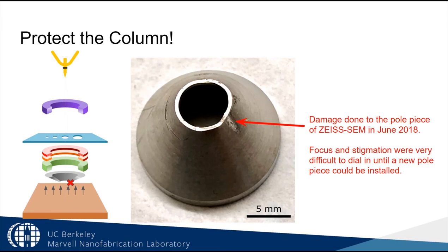This happened to Zeiss SEM in June of 2018, when someone ran the stage into the pole piece, which is a protective piece below the final objective lens. While it was possible to use the tool in this state, it was very difficult to correct the beam conditions. It is very important to be aware of your sample with respect to the delicate components of the beam to protect them from damage.